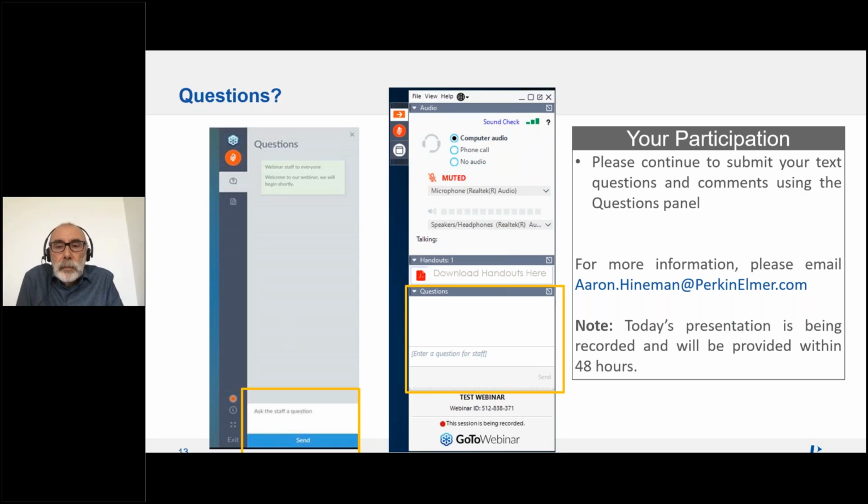Okay, thank you. And then, do you think that with larger particles, the residence time in plasma would be long enough for the particles to get volatilized? And if so, what would the upper size be? So I can ask that again. Do you think that with larger particles, the residence time in the plasma would be long enough for the particles to get volatilized?